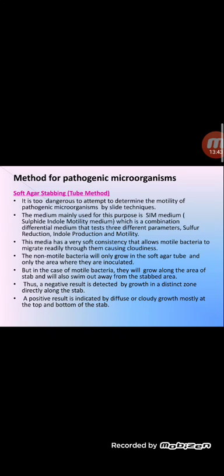So in this method we will use a SIM medium, which stands for sulfide indole motility medium.